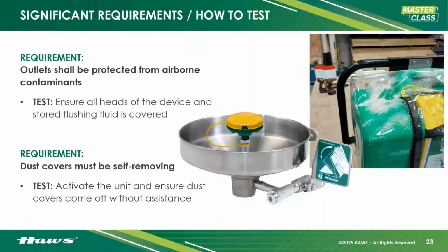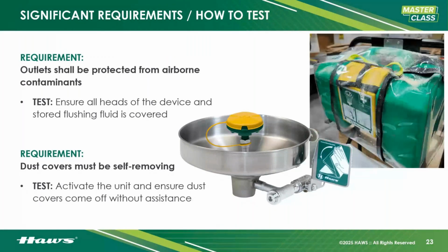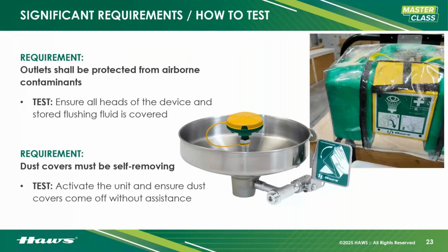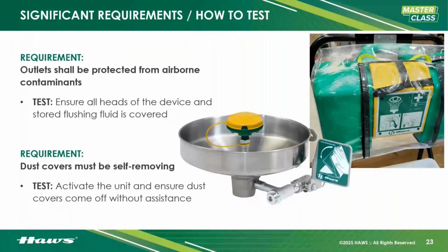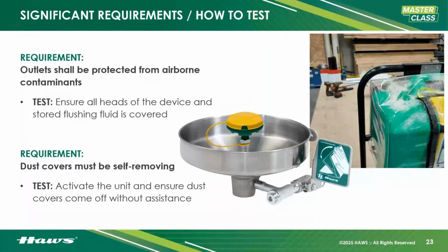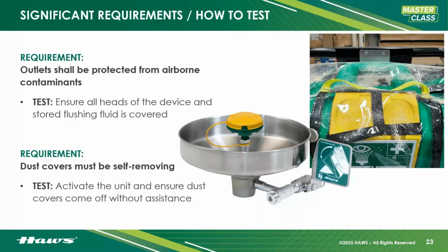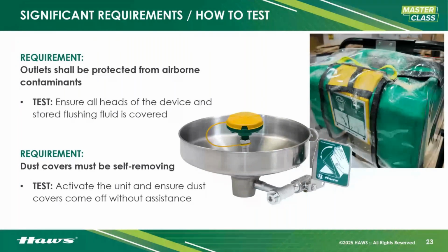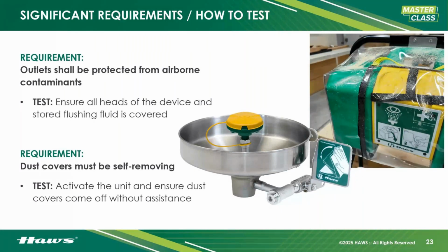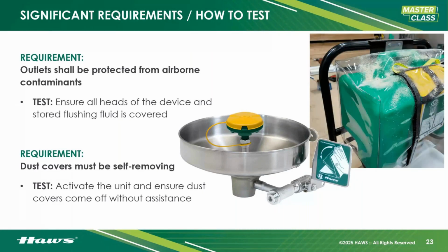And when you grab that handle, this part is incredibly important because both of these work the same way. As I grab that handle or I activate that paddle, the dust covers have to be self-removing, okay? Now our activation handle, for instance, on that jacket, if I were to grab that handle and tear down, it's gonna take the lid and peel it down with it. No matter what, if you approach emergency equipment, you need single point activation. For the dust cover, you can't have any additional steps to remove the dust cover.